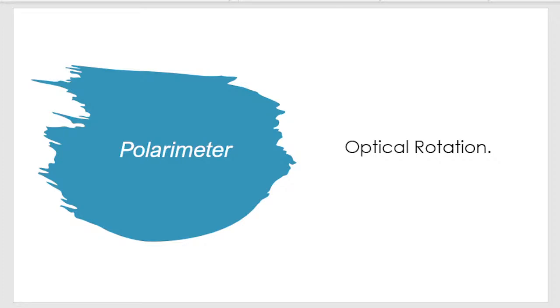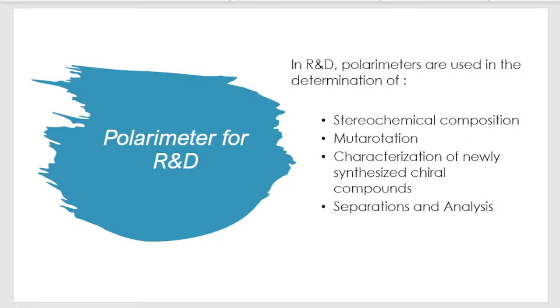And so polarimeters are very simple instruments. At least you can simplify it in terms of they measure optical rotation. But optical rotation in itself of different substances is a bit complicated. But basically a polarimeter measures optical rotation. Okay, an oversimplification of what it does.